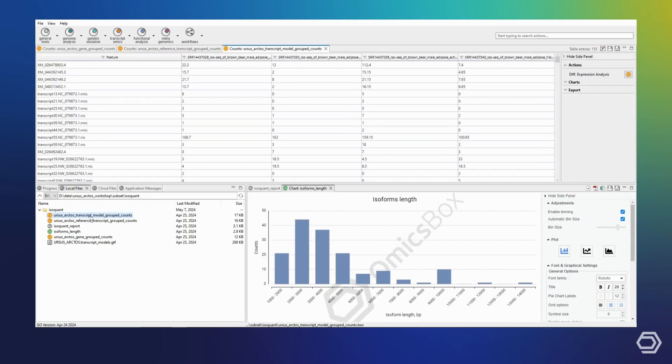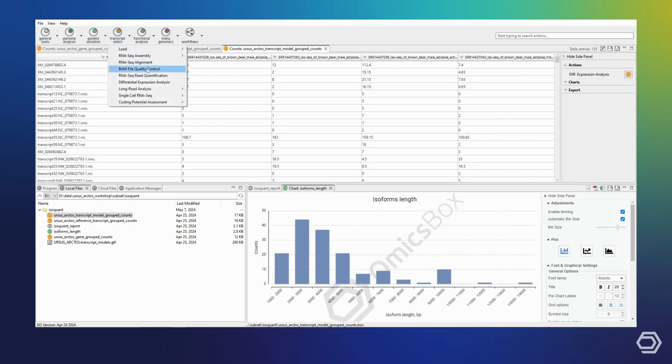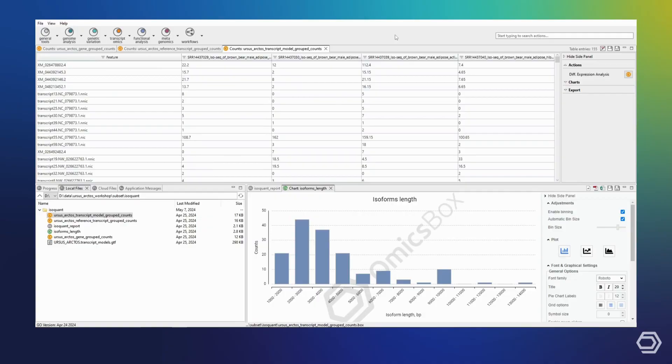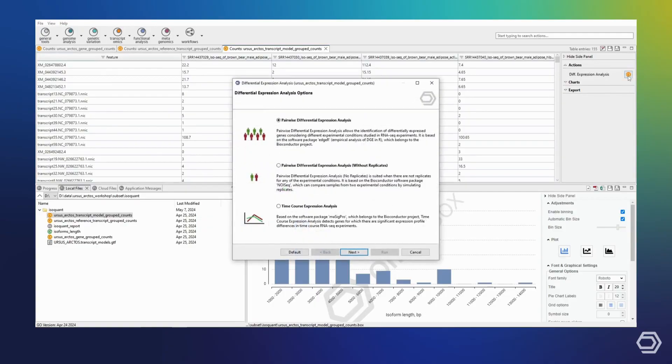All of these quantification files are separated by sample into four columns. From this point, you could continue by either running SQANTI3 within OmicsBox to perform quality control on our newly defined transcriptome and further refine it, or we can perform differential expression analysis based on our quantification results.